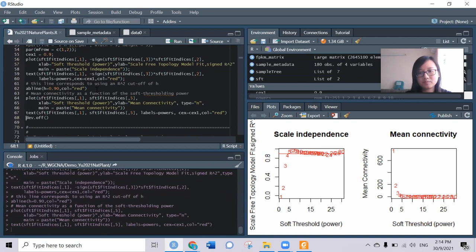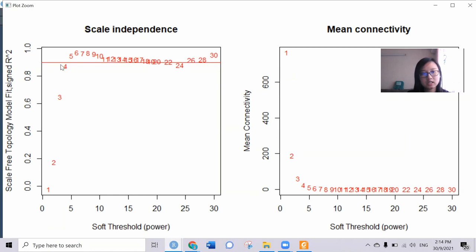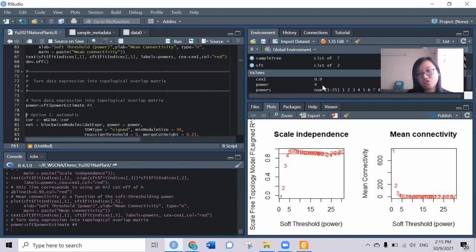We should be able to see a very nice exponential curve. This helps us decide what is the suitable power to use in the downstream. As we can see here, I think 4 is a good number. They also estimate that it should be 4.